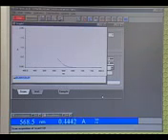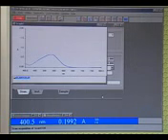Try to ensure that the concentration of your solution isn't too strong so that the peak goes above the graph, or too weak so there is no peak. The example shown here is about perfect.